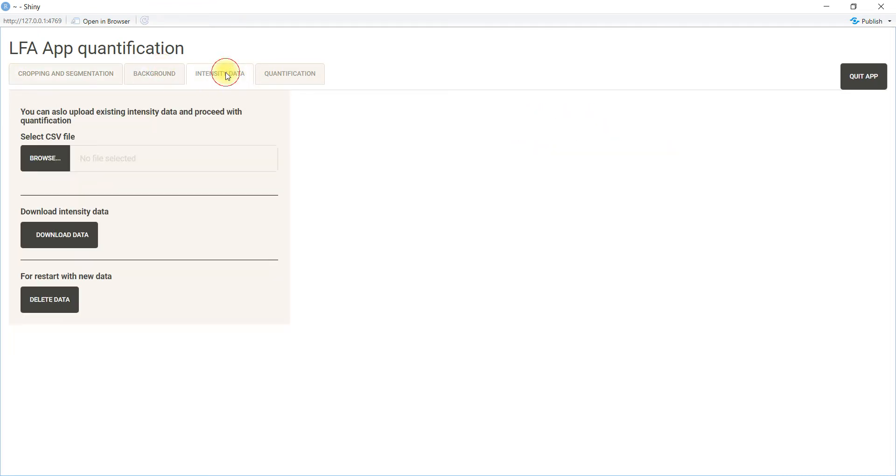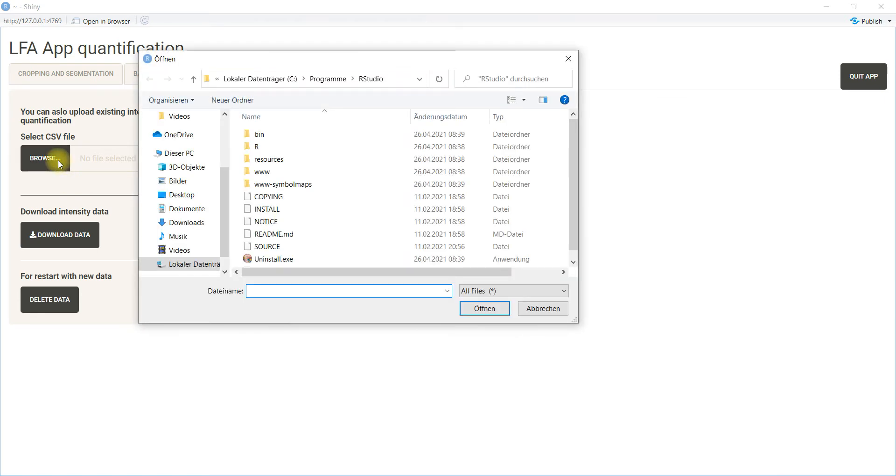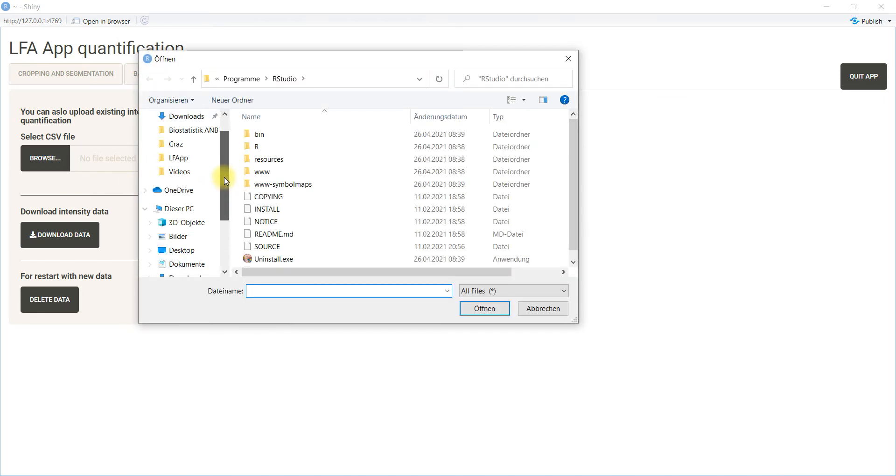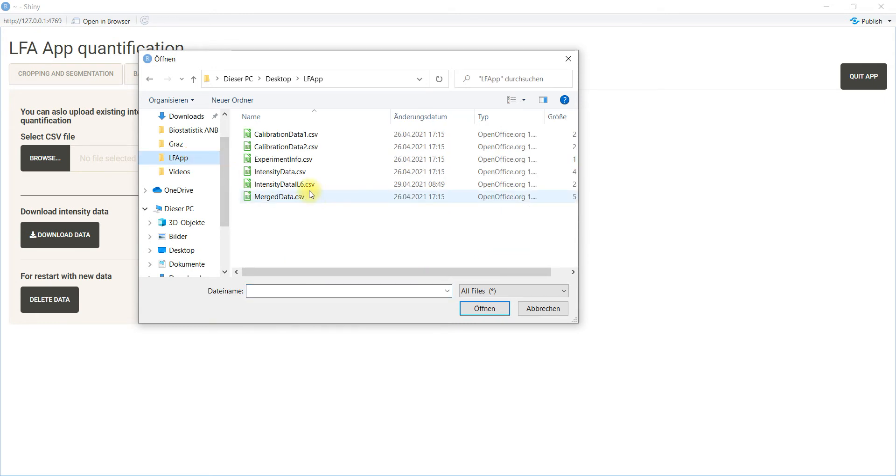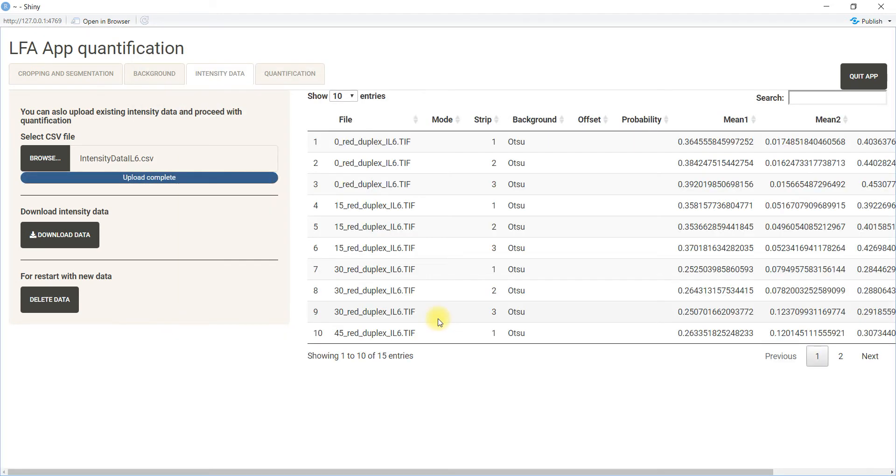For the demonstration, I will upload some data I have already prepared. Here it's data for IL6, so here we see I have uploaded some intensity data.